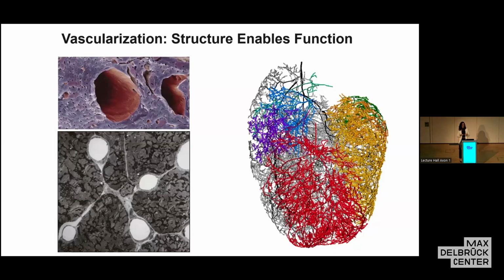So that's a really brief overview of engineering cardiac muscle. In that cardiac muscle, with all of this work, a summary of these many papers and translational effort, there were basically two main cell types: cardiomyocytes, derived from iPS cells usually, and about 10% fibroblasts. These fibroblasts were usually primary ventricular human fibroblasts, but they could also be fibroblasts coming out of directed differentiation, or CD90 cells. We didn't have any endothelial cells.